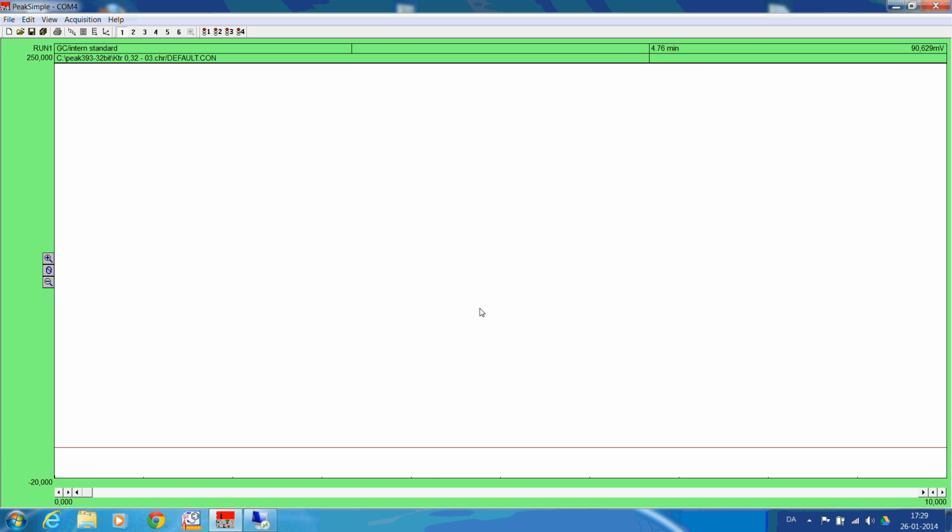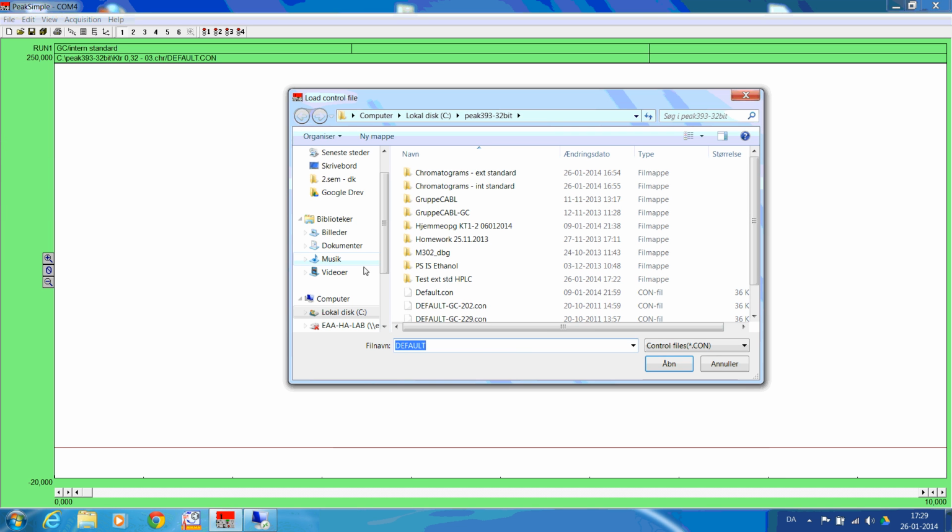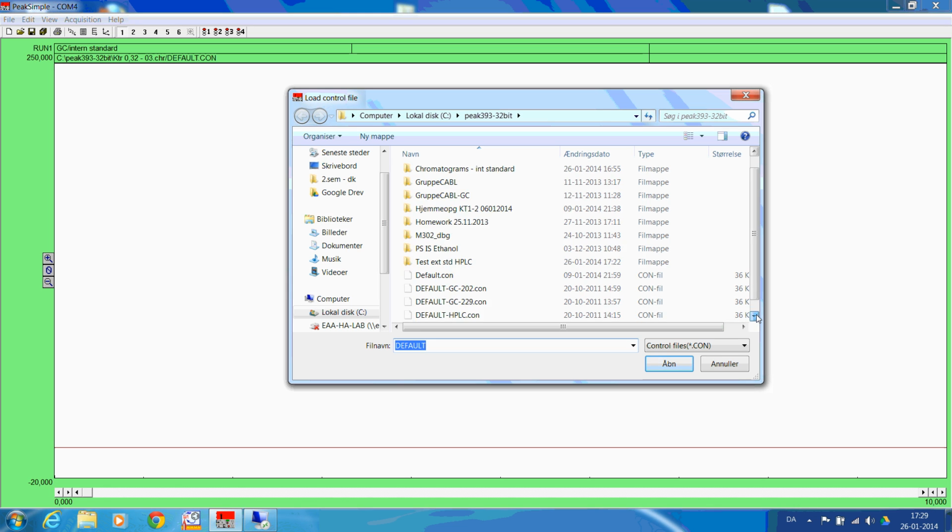In this video clip I will show you how to work with the external standard method in PeakSimple. First you open a suitable control file. That would be the default one for HPLC, because HPLC is normally where we work with the external standard method.